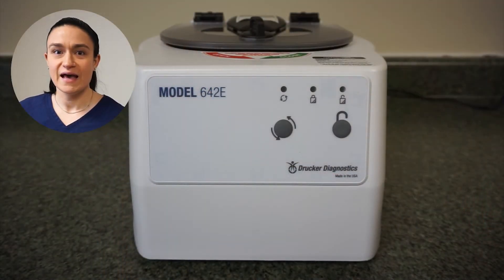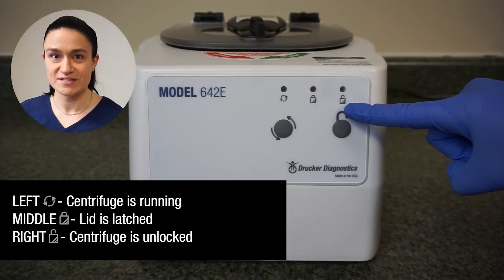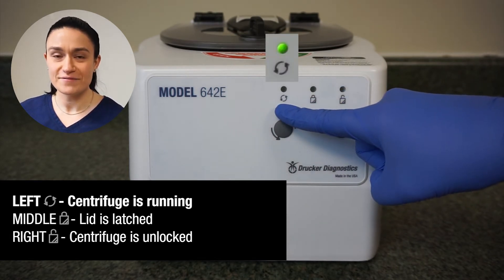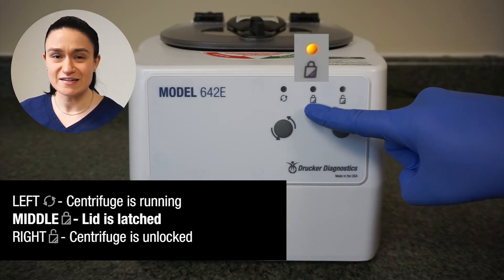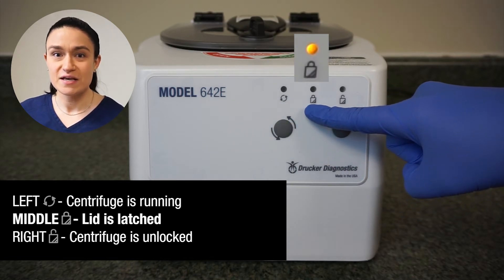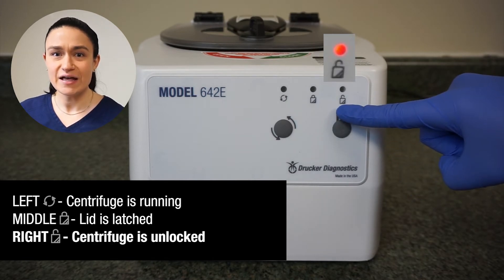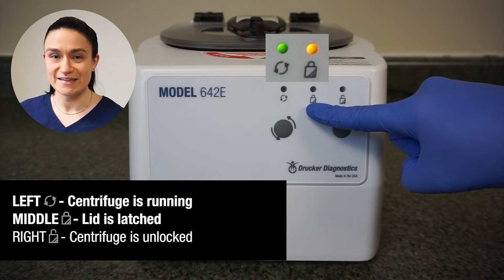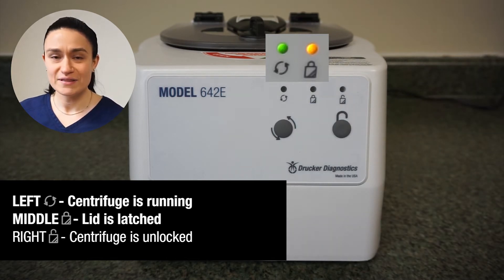Your 642e has three indicator lights that show its status. The left-hand LED illuminates whenever the centrifuge is running. The center LED illuminates whenever the lid is latched. The right LED illuminates whenever the centrifuge is unlocked. The left running and center latched LEDs are commonly illuminated at the same time, because anytime the centrifuge is running, the lid must be latched.